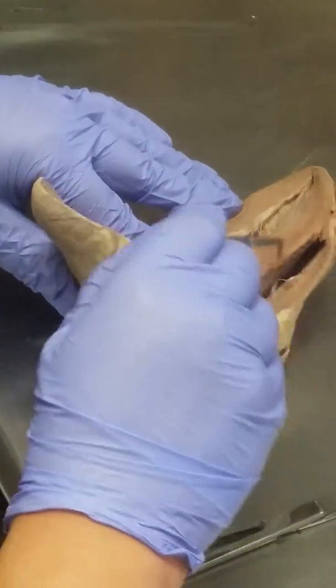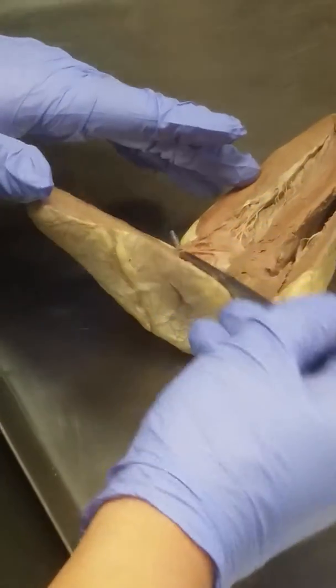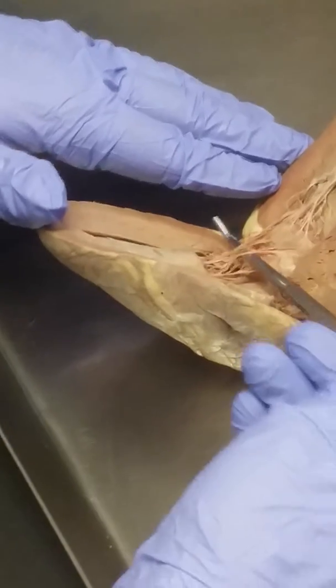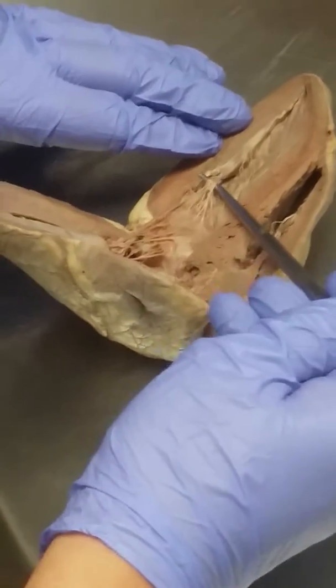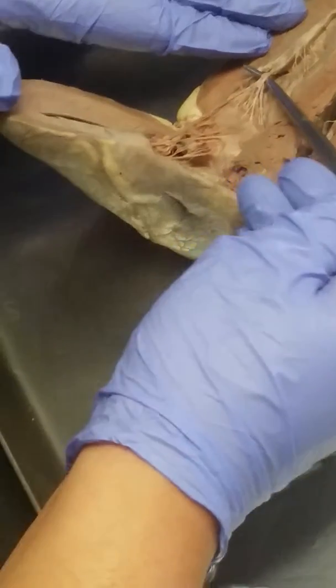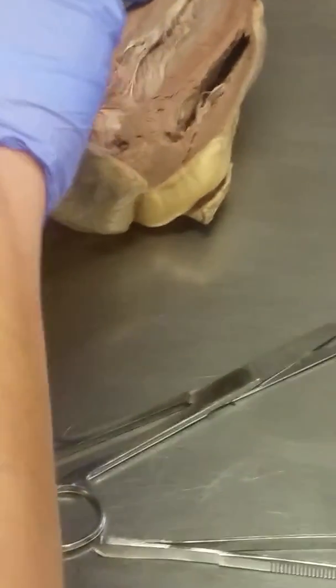Now, if you look in here, this is the right ventricle. This is the left ventricle. Do you see these string structures here? Can you see? Yeah. Those are chordae tendineae, right? And if I tug on one, notice how it's tugging on that. That's the papillary muscle, right? If this is the papillary muscle and this is the chordae tendineae, what is this thing that I'm moving?